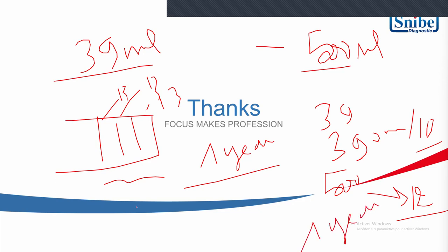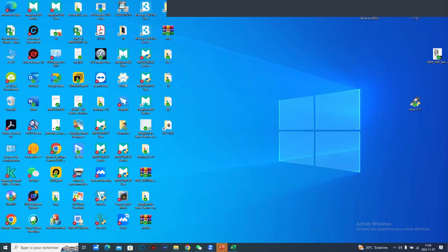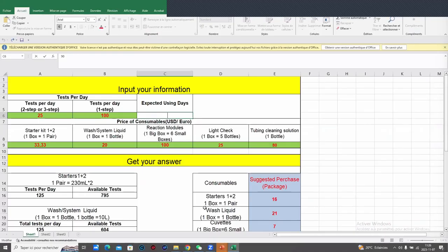But if it is, for example, 4000 or 2000, they have 2 pipettors, so we will use two. It will consume more than 39. It will give us 6 maintenance, which means 6 months. For 800, it is 1 year.